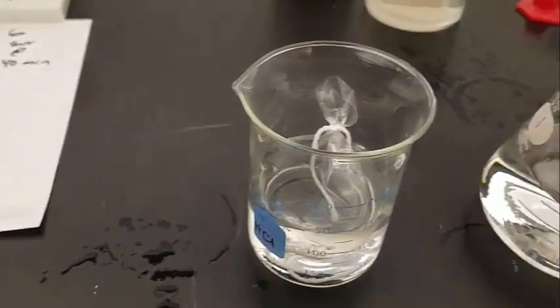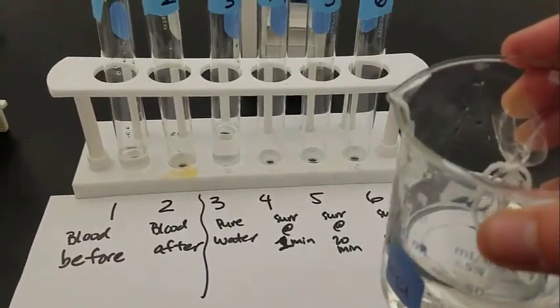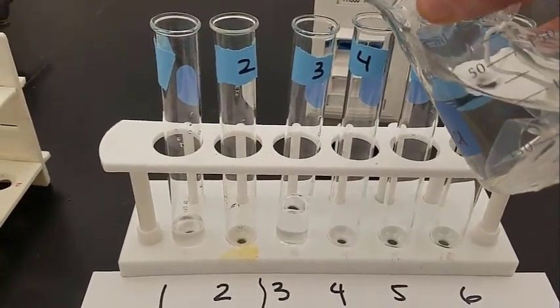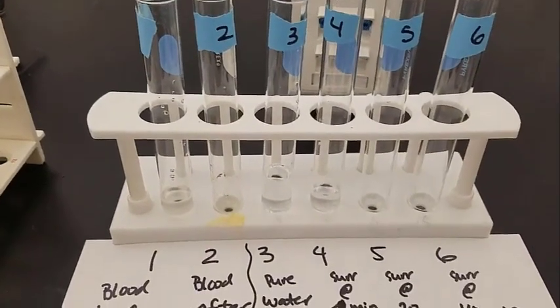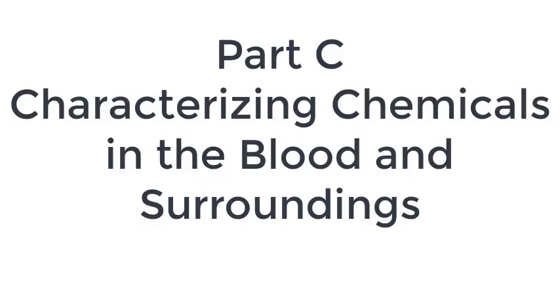We're going to see if the solutes will diffuse from inside the dialysis bag out. We've got our six test tubes set up here. At one minute, we'll pour some surrounding water into test tube four to see if anything diffuses out immediately. Then we'll let that beaker sit for another 40 minutes.